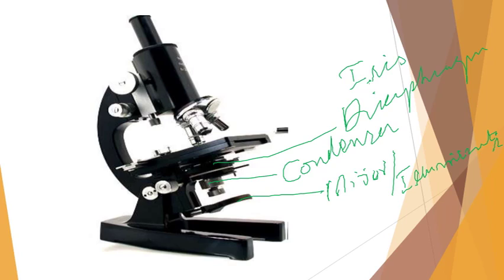Iris diaphragm. So these are the illuminating parts of the microscope.